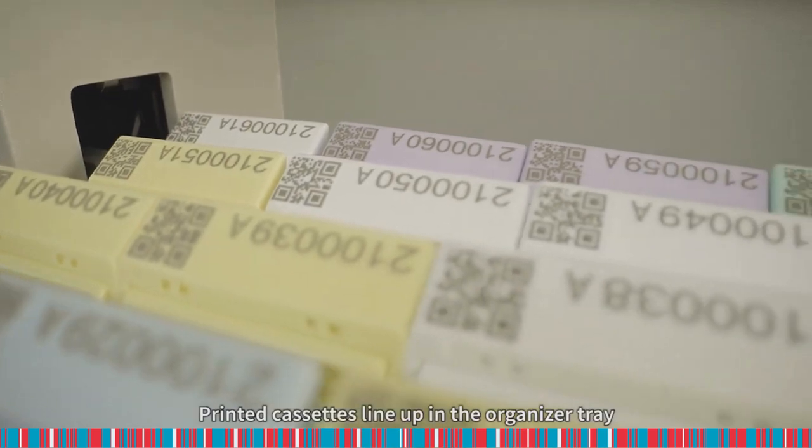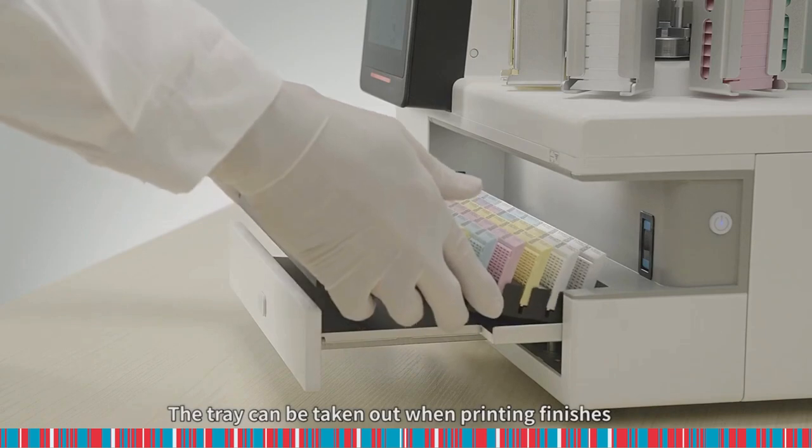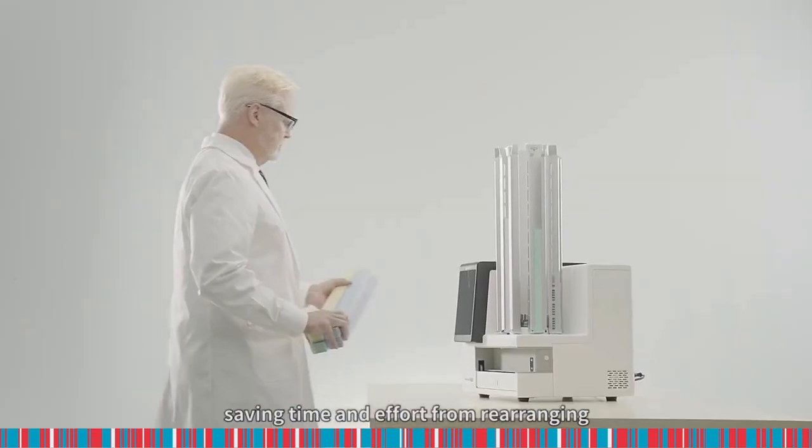Printed cassettes line up in the organizer tray. The tray can be taken out when printing finishes, saving time and effort from rearranging.